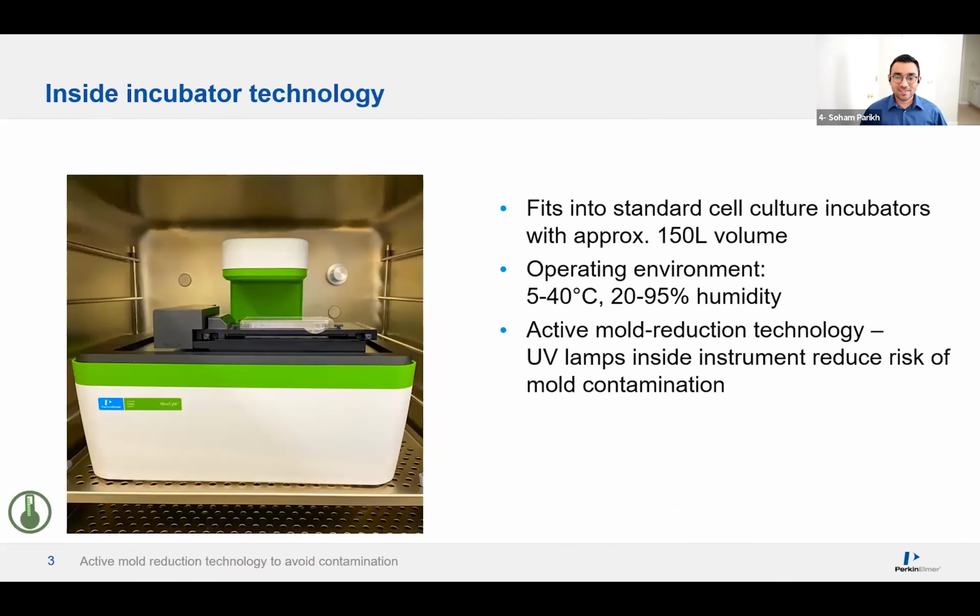So this slide is actually, this particular instrument is installed at MBC. This is actually the same MuviCyte that has been installed. This is your own incubator. And Greg from your facilities team was kind enough to send me a picture of that. So as you can see, all nice and pretty, it's already installed, and you can see a plate which is already loaded on this instrument.